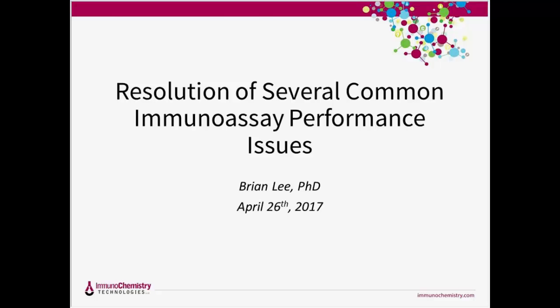Good morning, everybody. The topic of this webinar today is to try to address a few of the common universal problems with immunoassays. These cross the board from ELISA to paper strips to beads to whatever, so we're going to use some generic analogies for this presentation. We'll use ELISA plate for the most part because it's something that's most familiar to everybody, but we're trying to be a broader brush when we talk about some of the problems that people encounter.